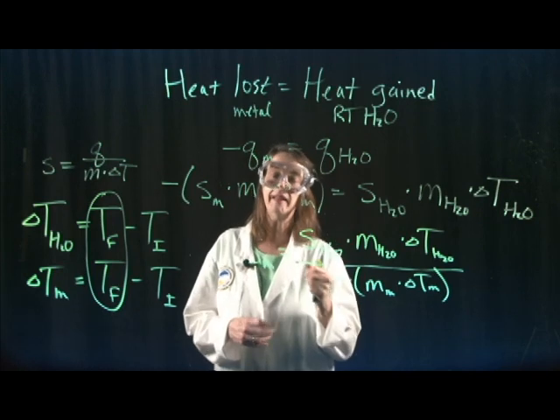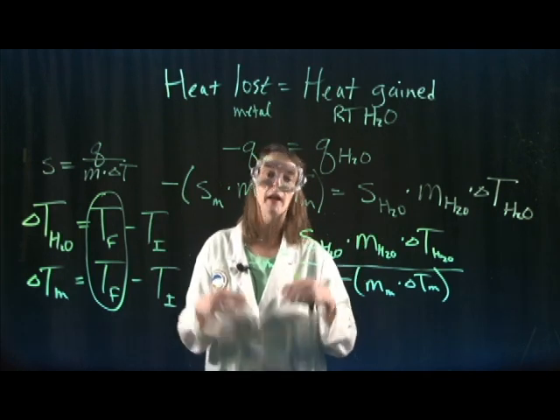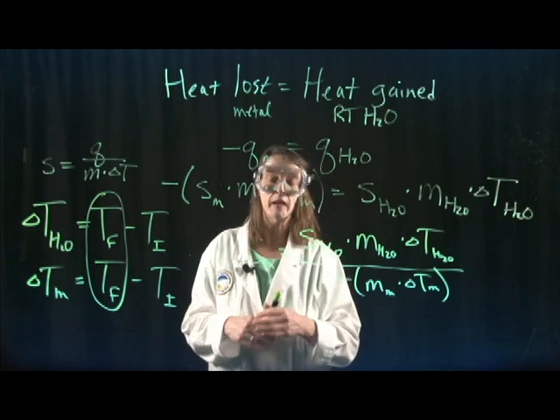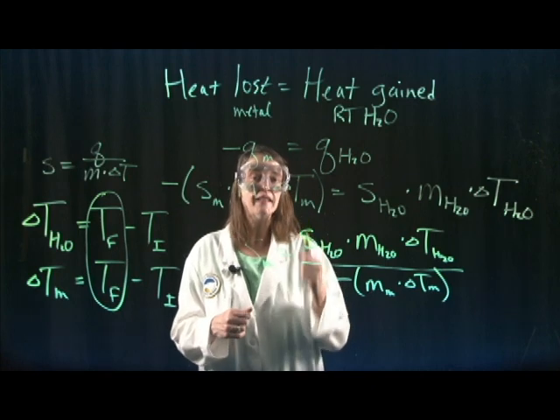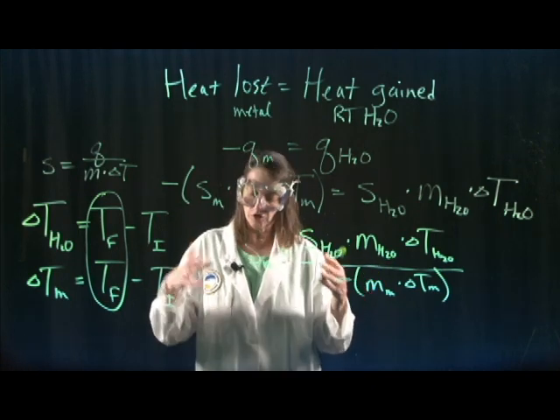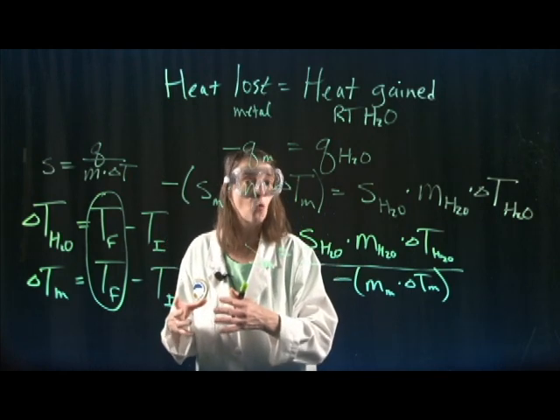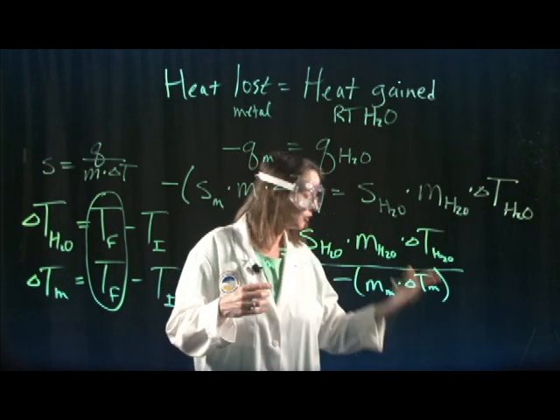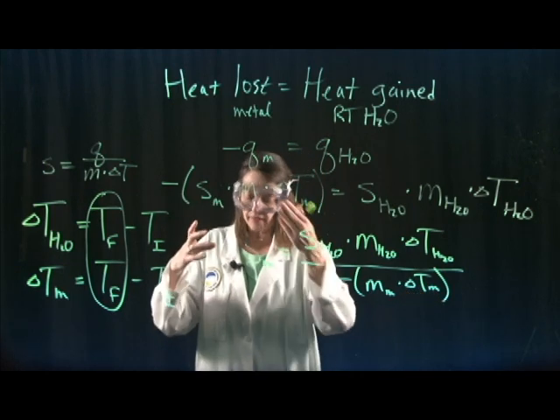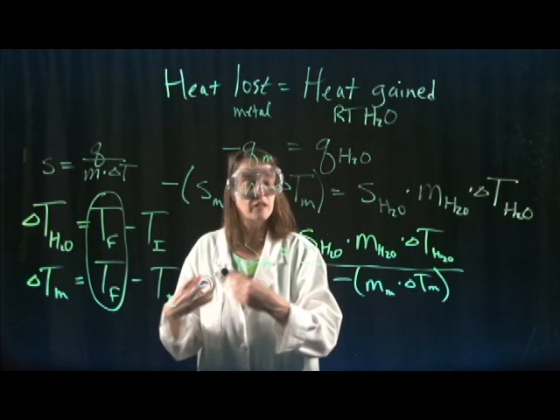That is all Part A. Part B of the lab is much simpler. You're not heating up anything in Part B. What you're doing is looking at the heat of solution for an ionic compound. So you're going to have a weighed out amount of water, and you're going to weigh a certain amount of a solid compound and then put that in the water and dissolve it.